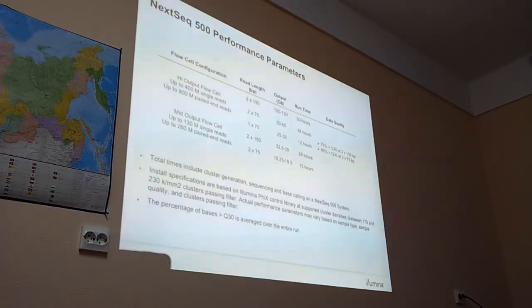The main question is, for example, if they perform a project in Design Studio, for example, enrichment, would it be suitable? How can they detect which cartridge or which machine they should use? Of course, it strongly depends on the size and the number of samples, the cumulative length of your region of interest, and the number of samples. And you can calculate the coverage. It's pretty easy. There are some coverage calculators.